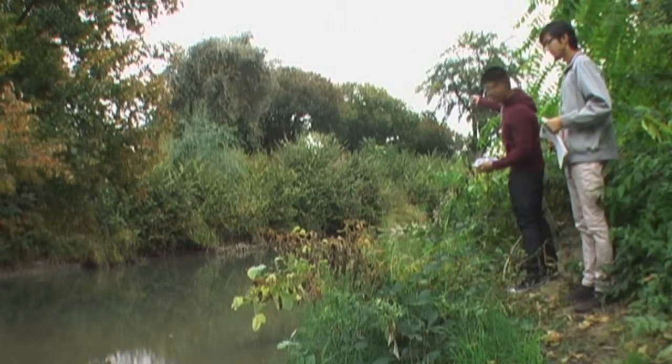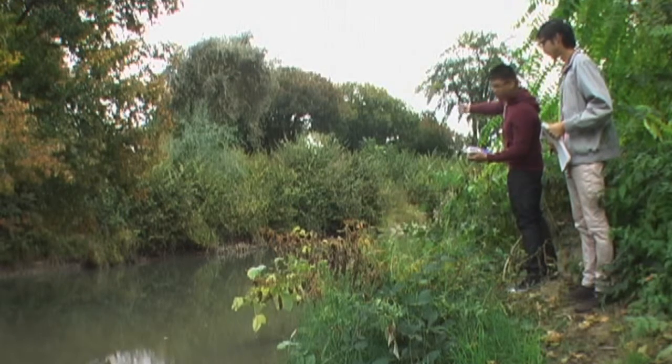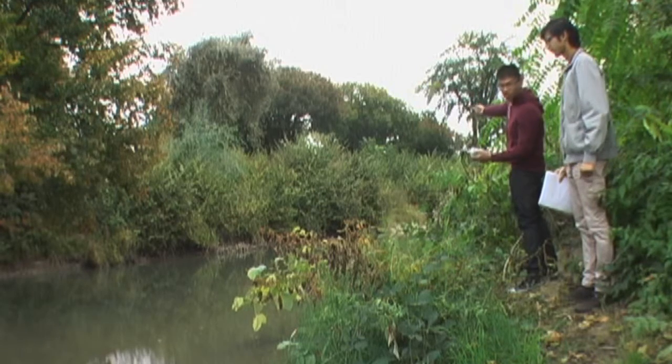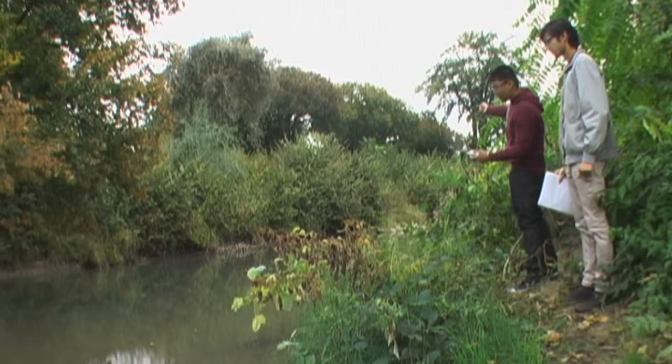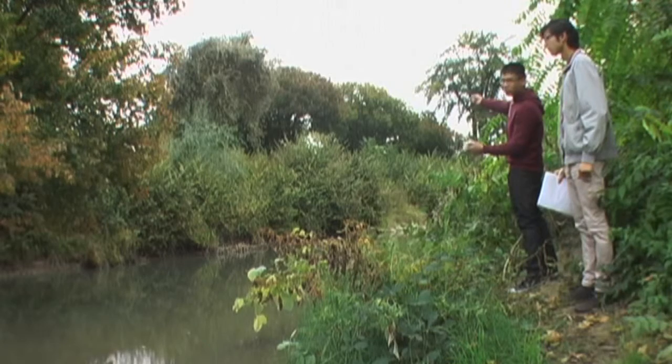Alright, so what we're doing today, this is the DO meter. I'm going to throw it in the water, and it's going to record the dissolved oxygen, temperature, as well as the percent saturation. I'm going to throw it in this water, which looks kind of green, so we're going to get some interesting levels of DO and stuff.